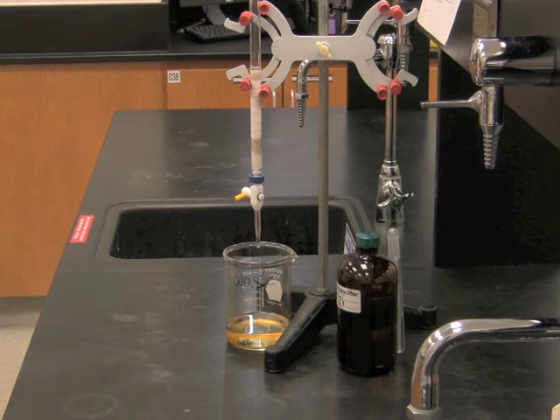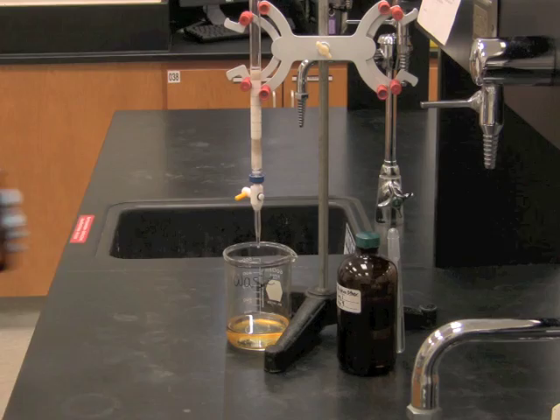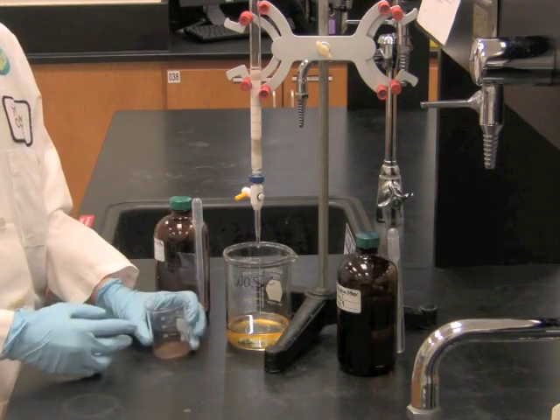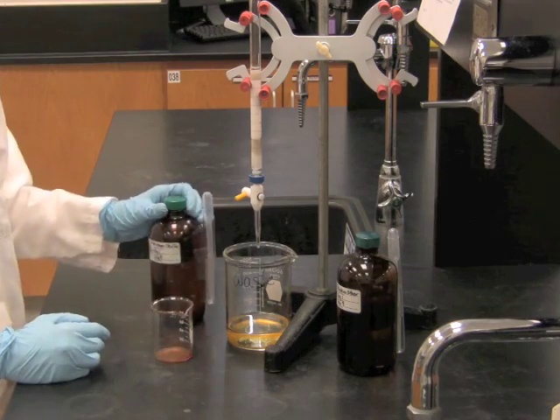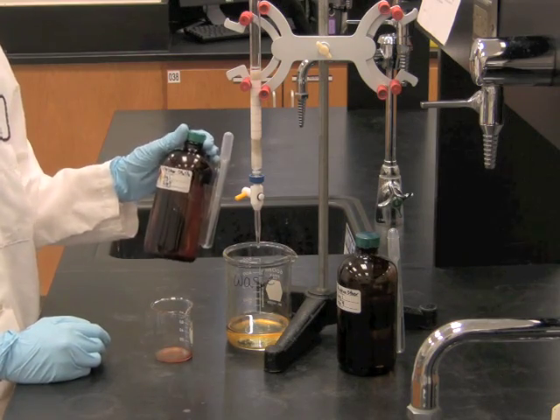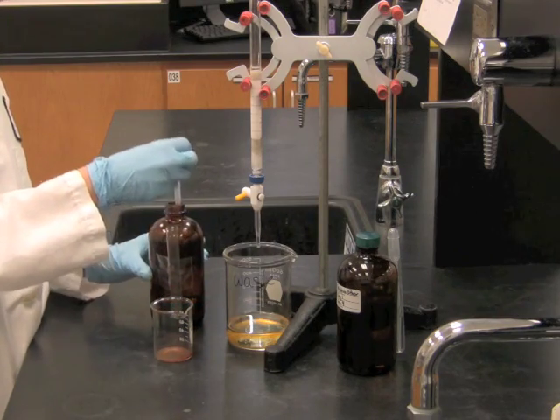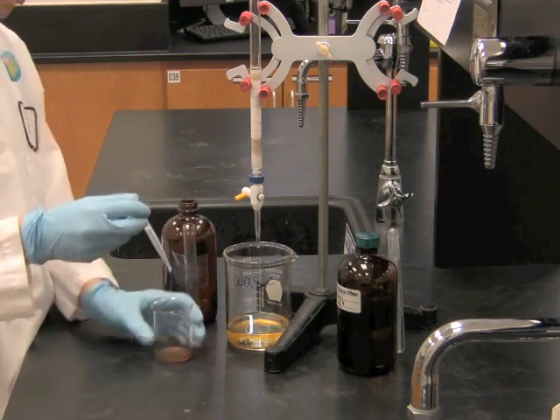Once your column is ready, you can get your very dry sample out of the fume hood. We're going to reconstitute that with just a little bit of the same solvent that we used before, the petroleum ether and dichloromethane. We're only going to use about one or two milliliters to do that.